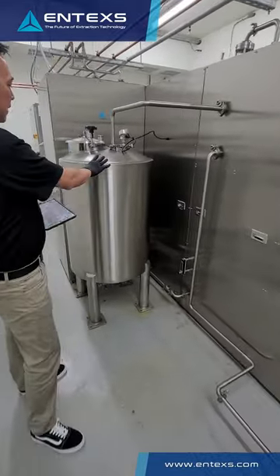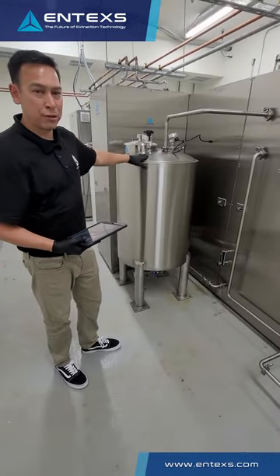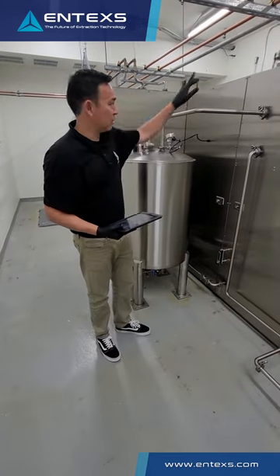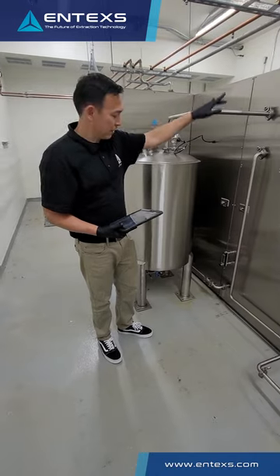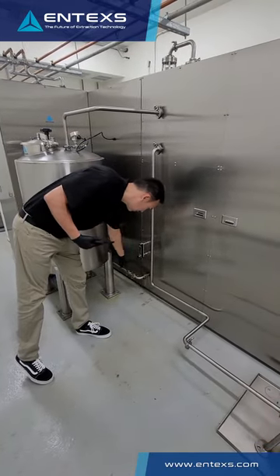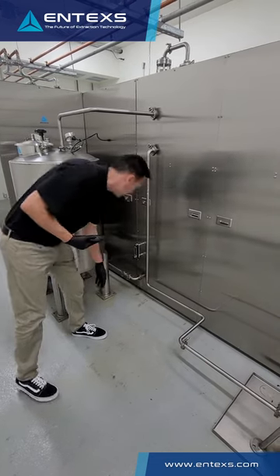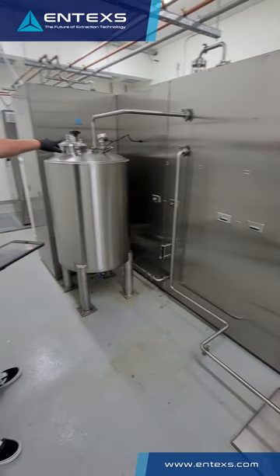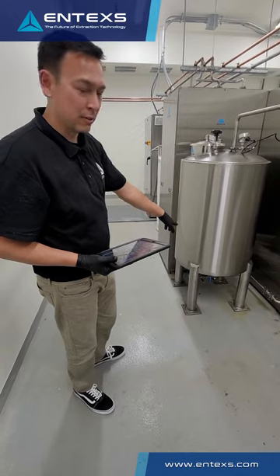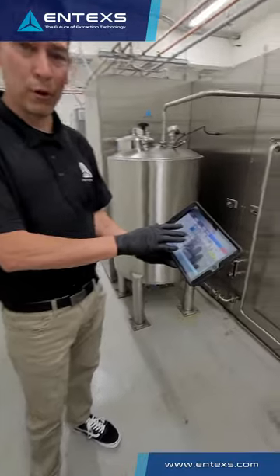On the back of the equipment here is the evap-feed tank. This is where post-filter tincture is stored and sent to the evaporation system. We can monitor flow rates using a level controller or flow controller, and we can also look at quality coming into the equipment. This is fitted with level sensors and temperature sensors for feedback to the system. This can also be started from the remote touchpad.